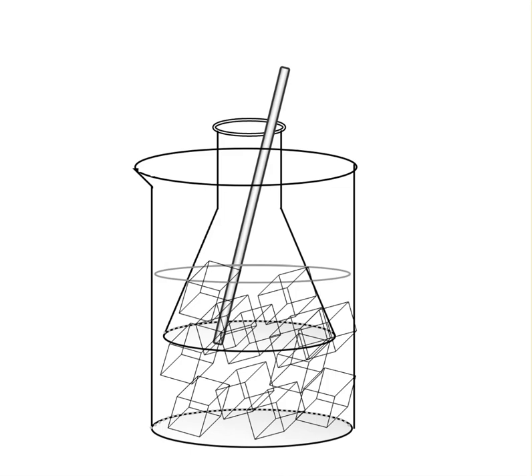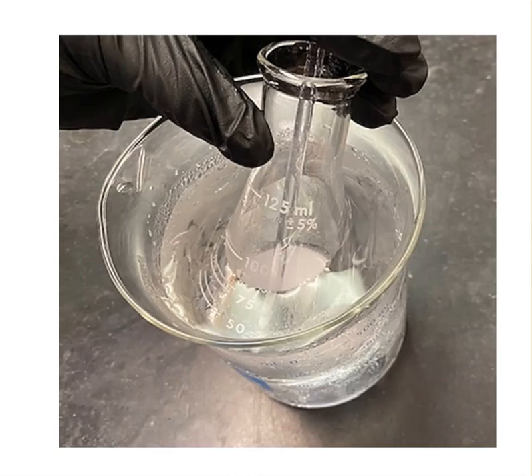After we add some cold water to the flask, we dip it down into an ice water bath. When you use the glass rod to rub on the bottom, we call that scratching it. It helps the crystals come out of solution. So when you do this, you'll start seeing the white substance in the flask. And here's a picture of what that looks like. This white substance that we see there is the aspirin.